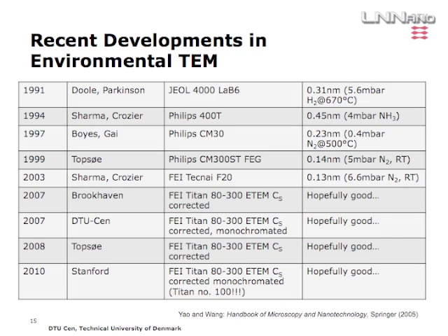When you ask FEI, they do not want to quote any resolution numbers on the ETEMs, so I only put hopefully good. As you'll hopefully see from the slides later on, it is quite good. There are a couple of them now, and actually the ETEM at Stanford, which was delivered last year, was Titan number 100.